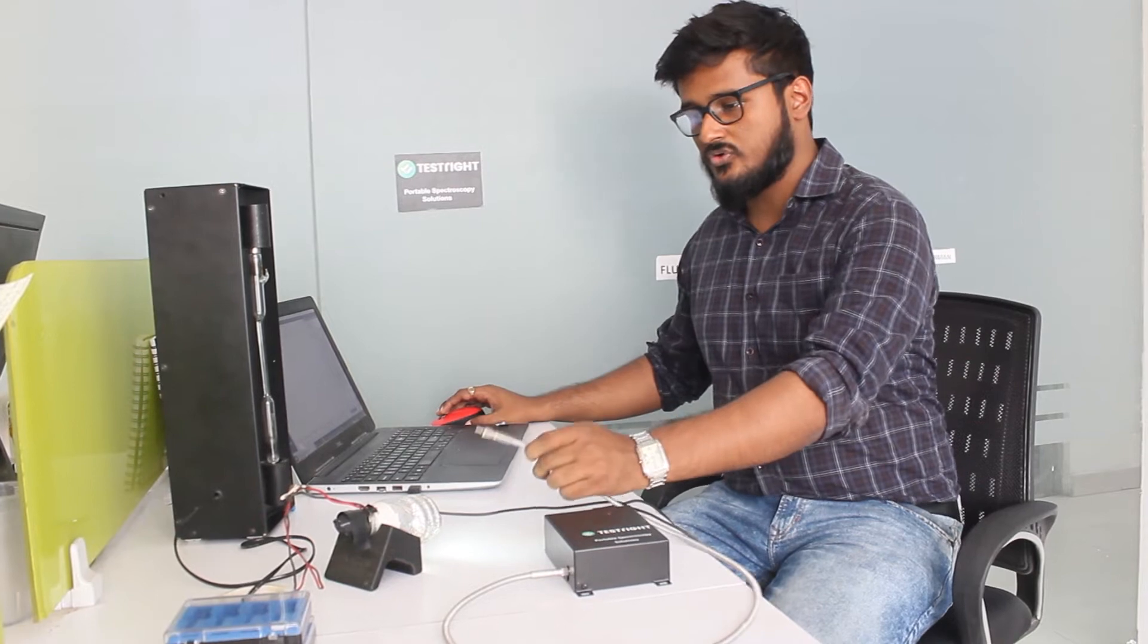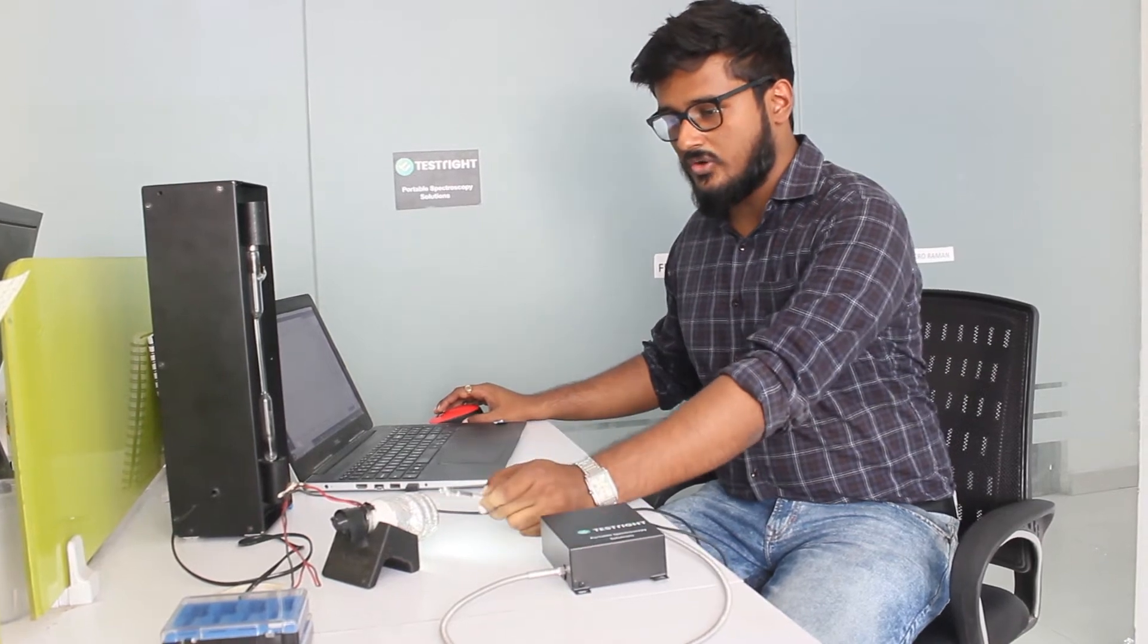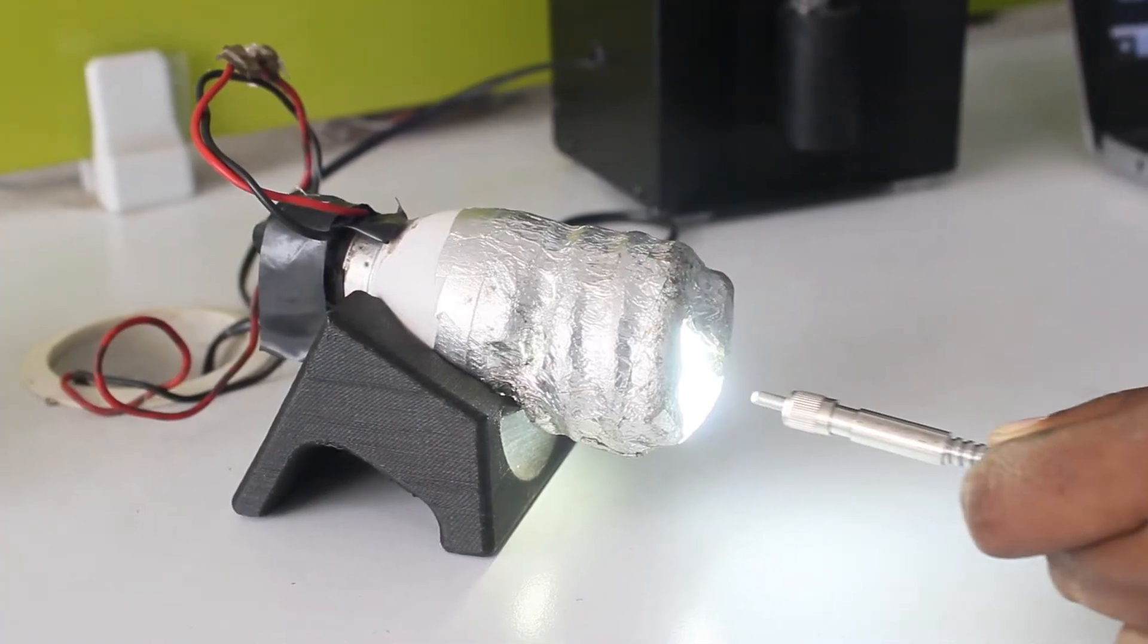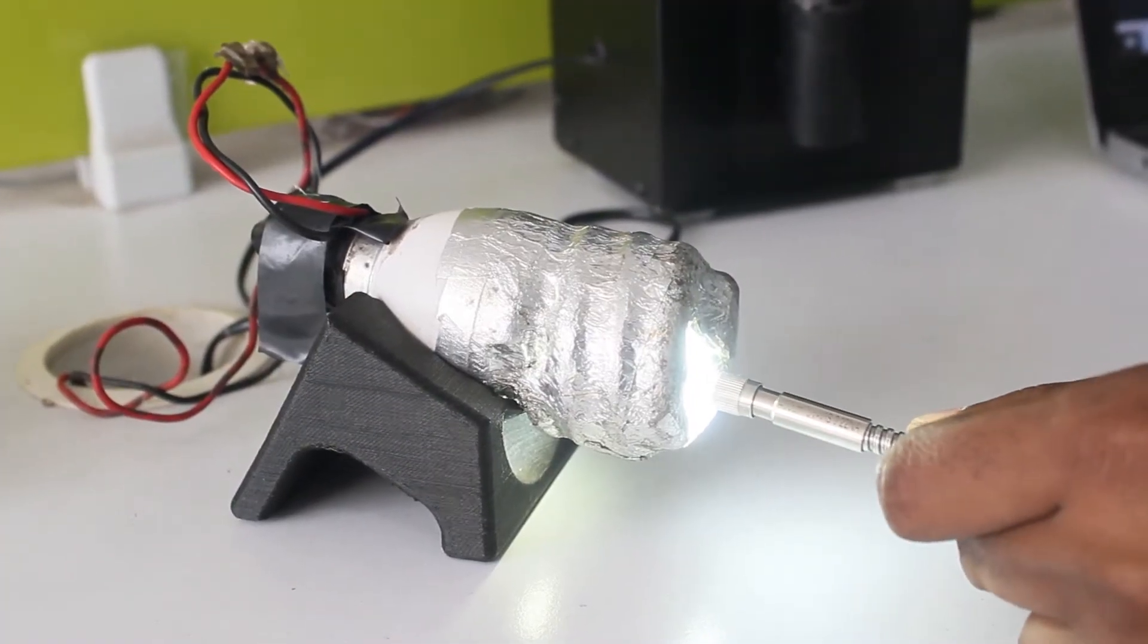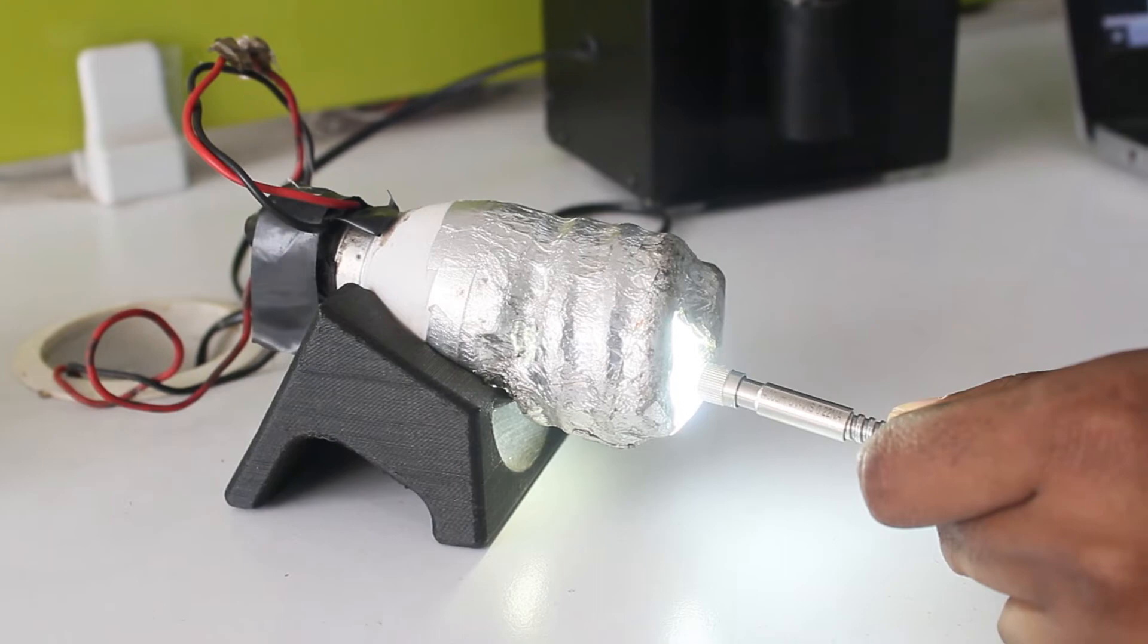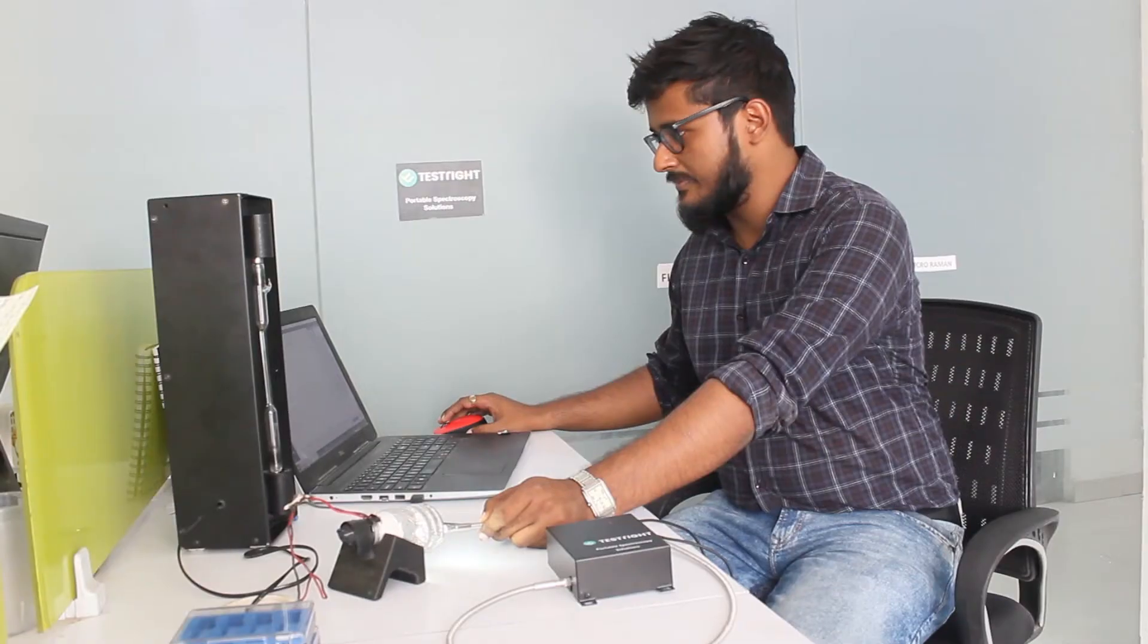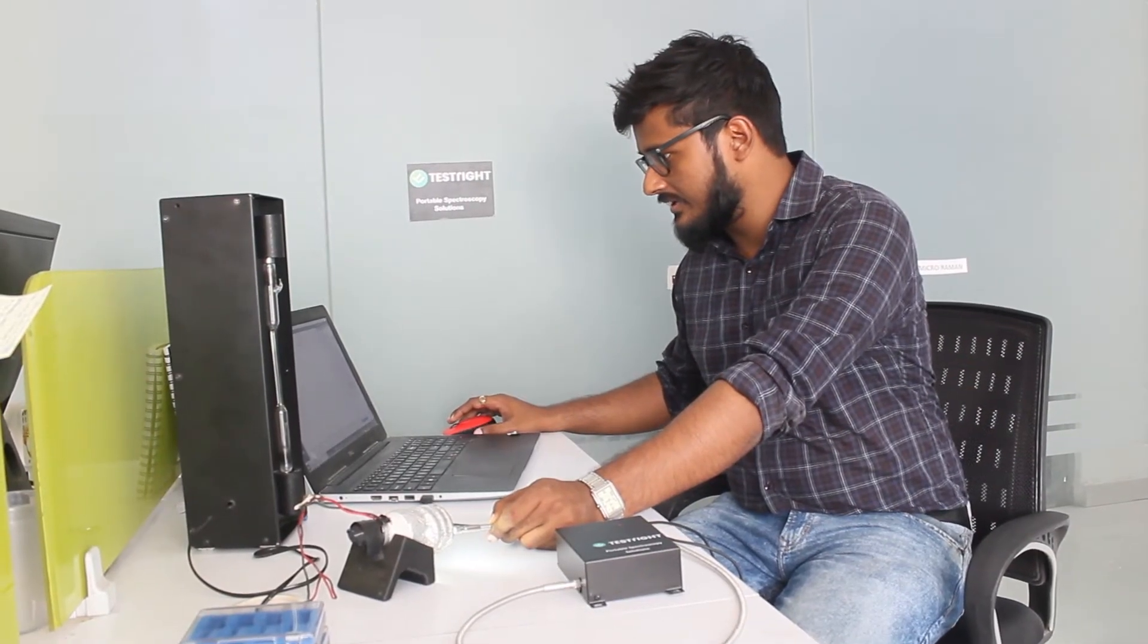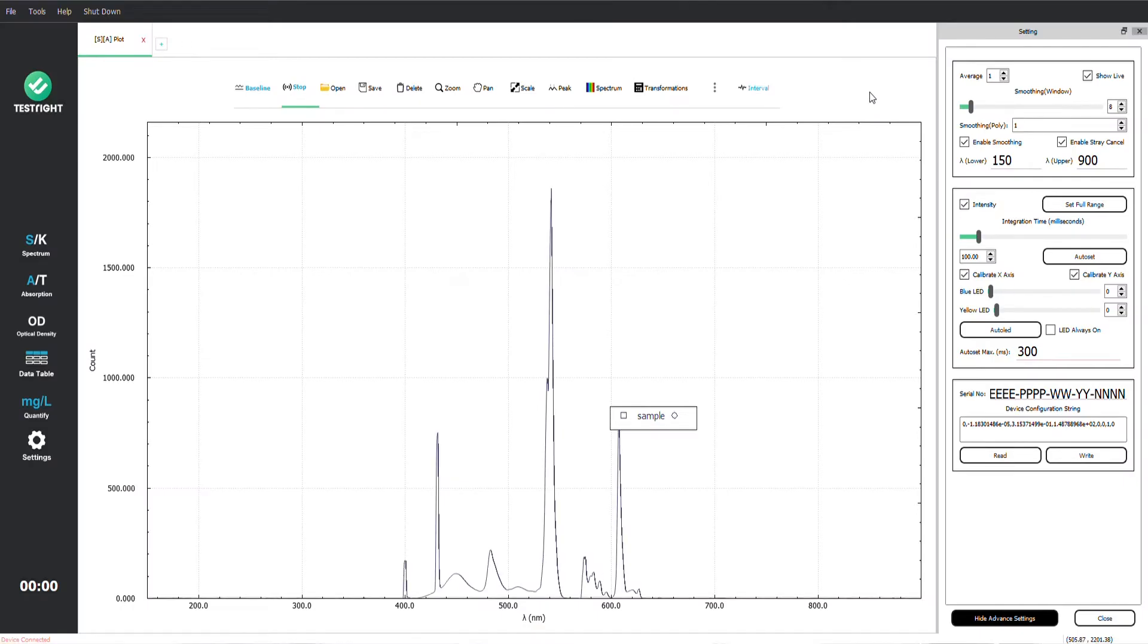So I am going to go ahead and point the optical fiber towards this CFL lamp and here you can see the beautiful spectra of the CFL lamp.